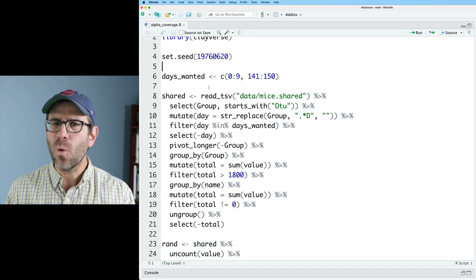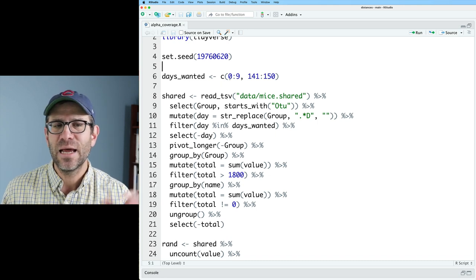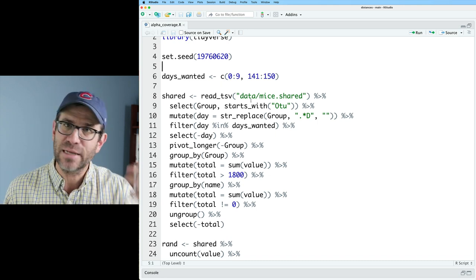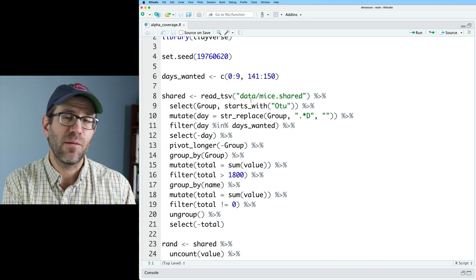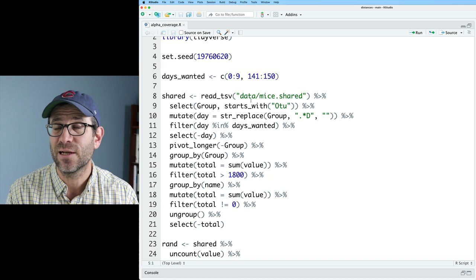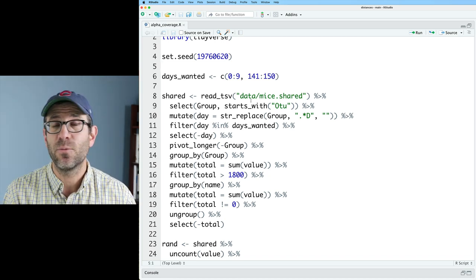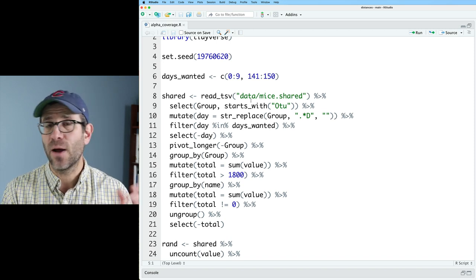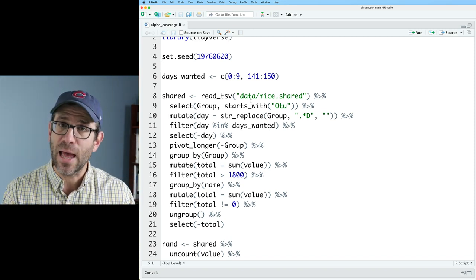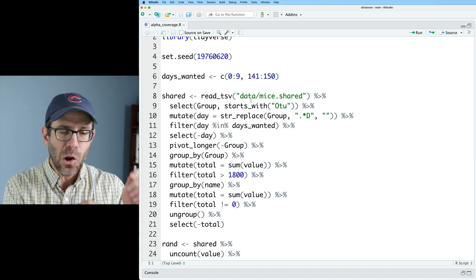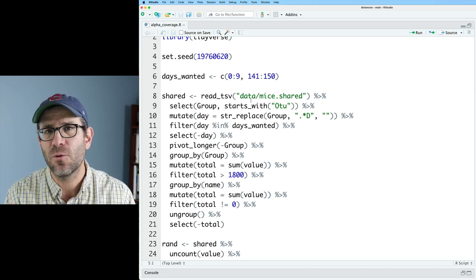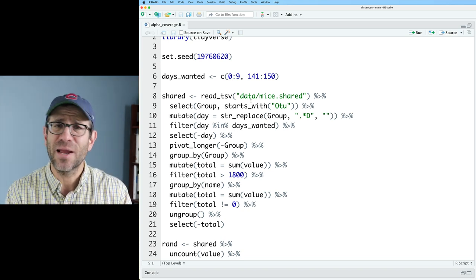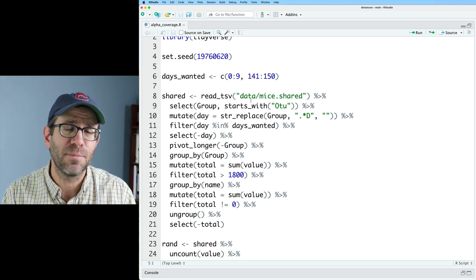It's been a while since I talked about this pipeline. Days wanted - these are the days that I want to extract data from my study. My study was originally published many years ago using 454 sequencing technology. Later, when we were developing our MiSeq pipeline, we resequenced all those samples. Those samples originated from a collection of mice that my lab had in its mouse breeding facility.